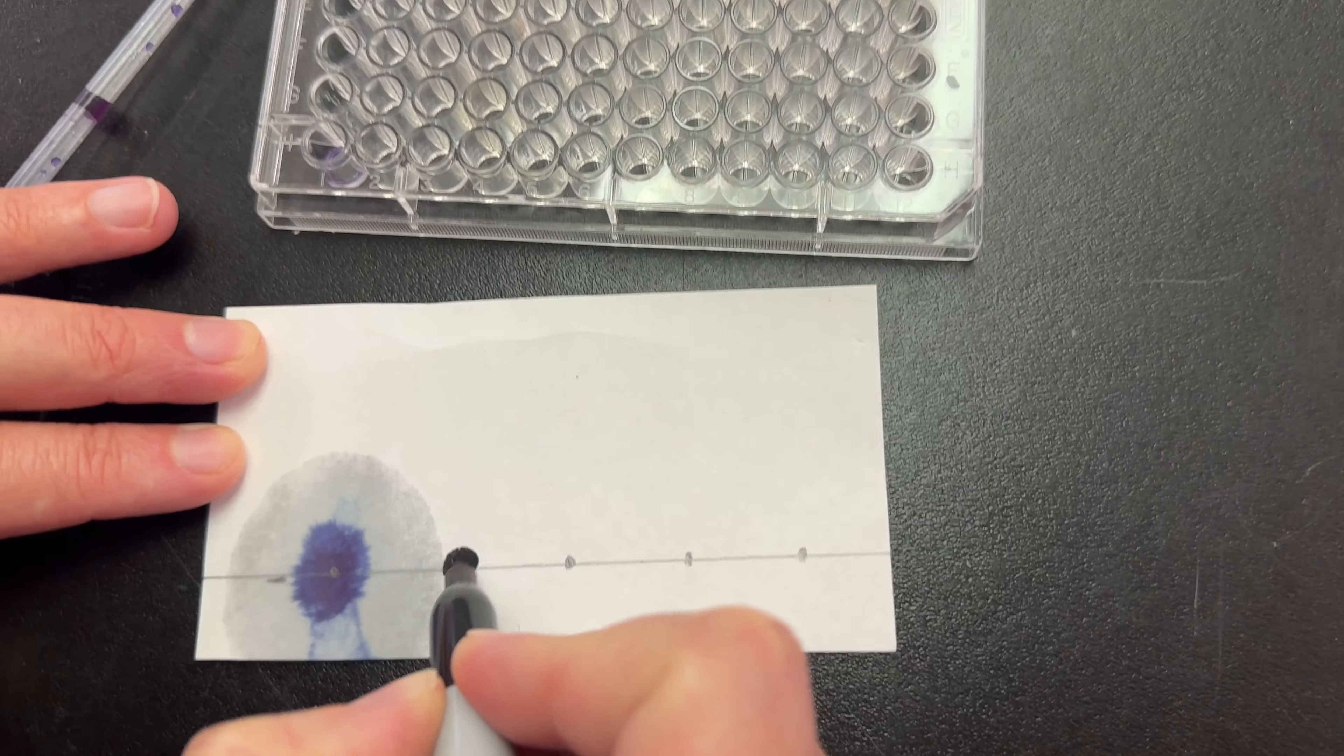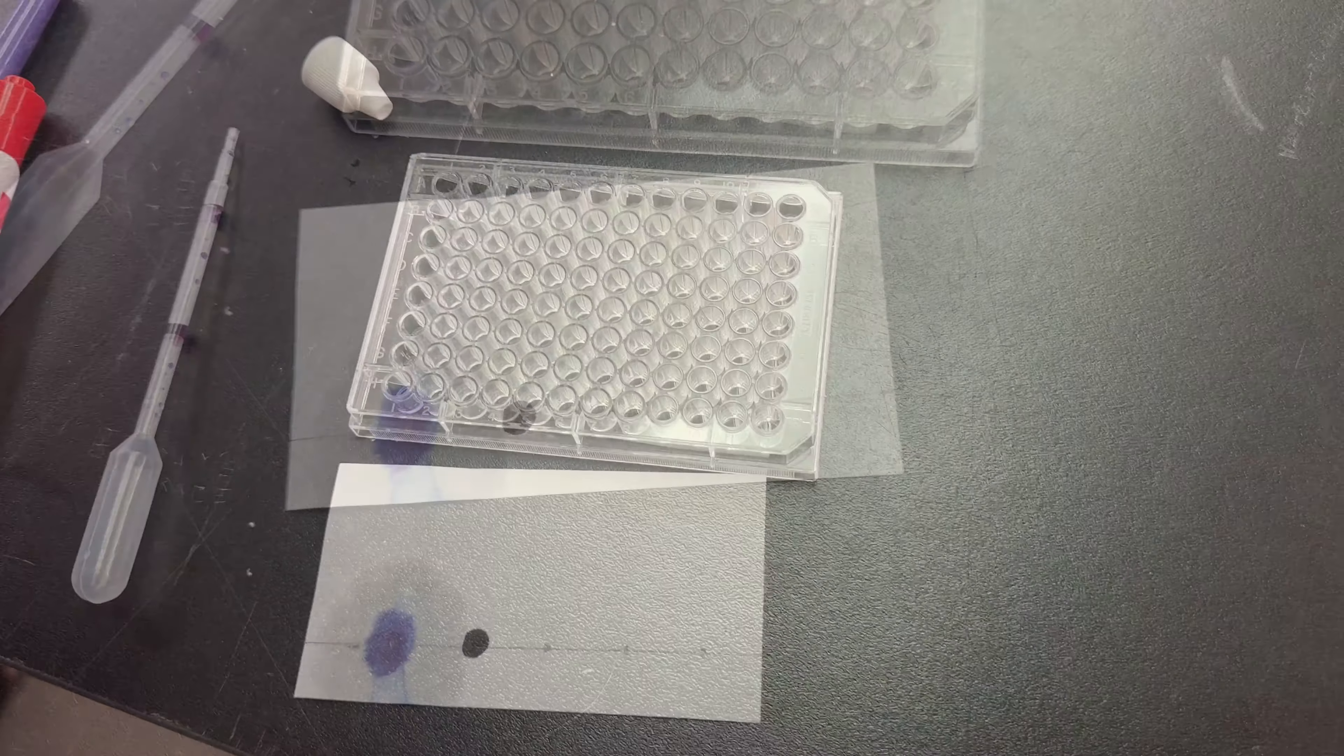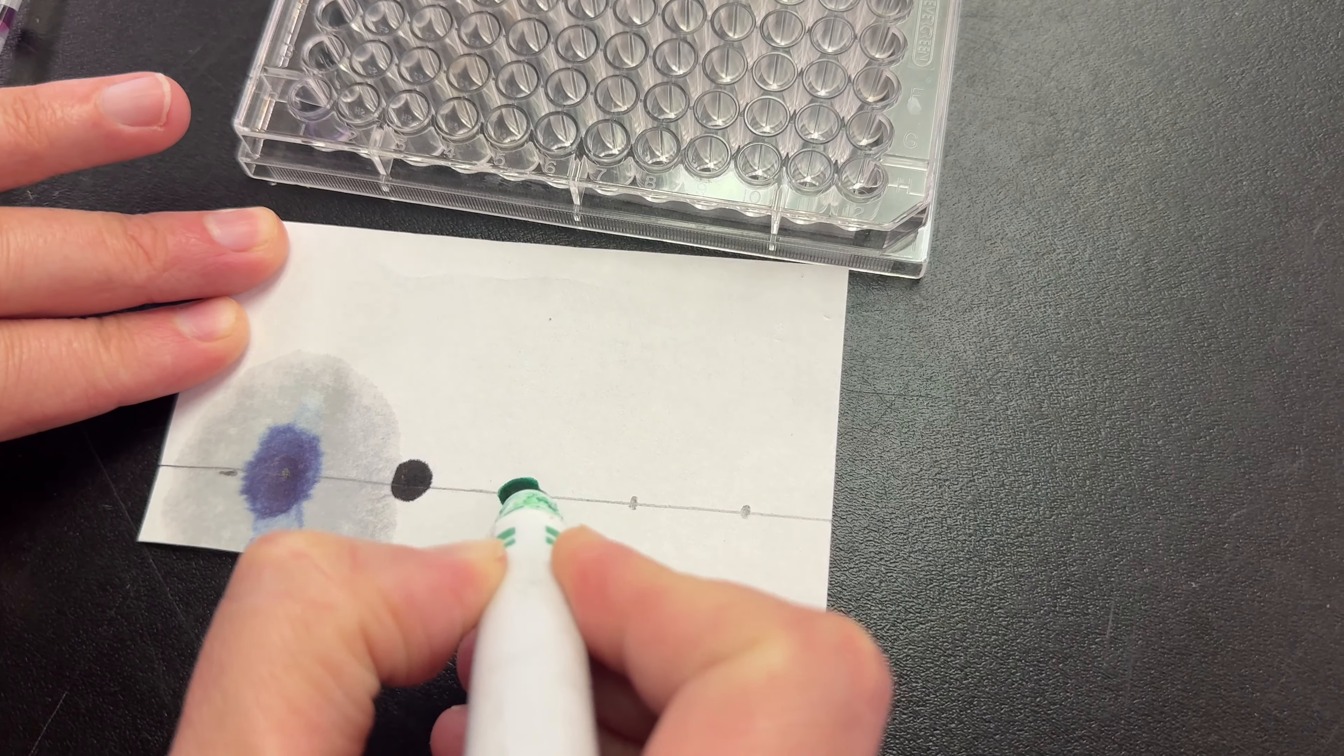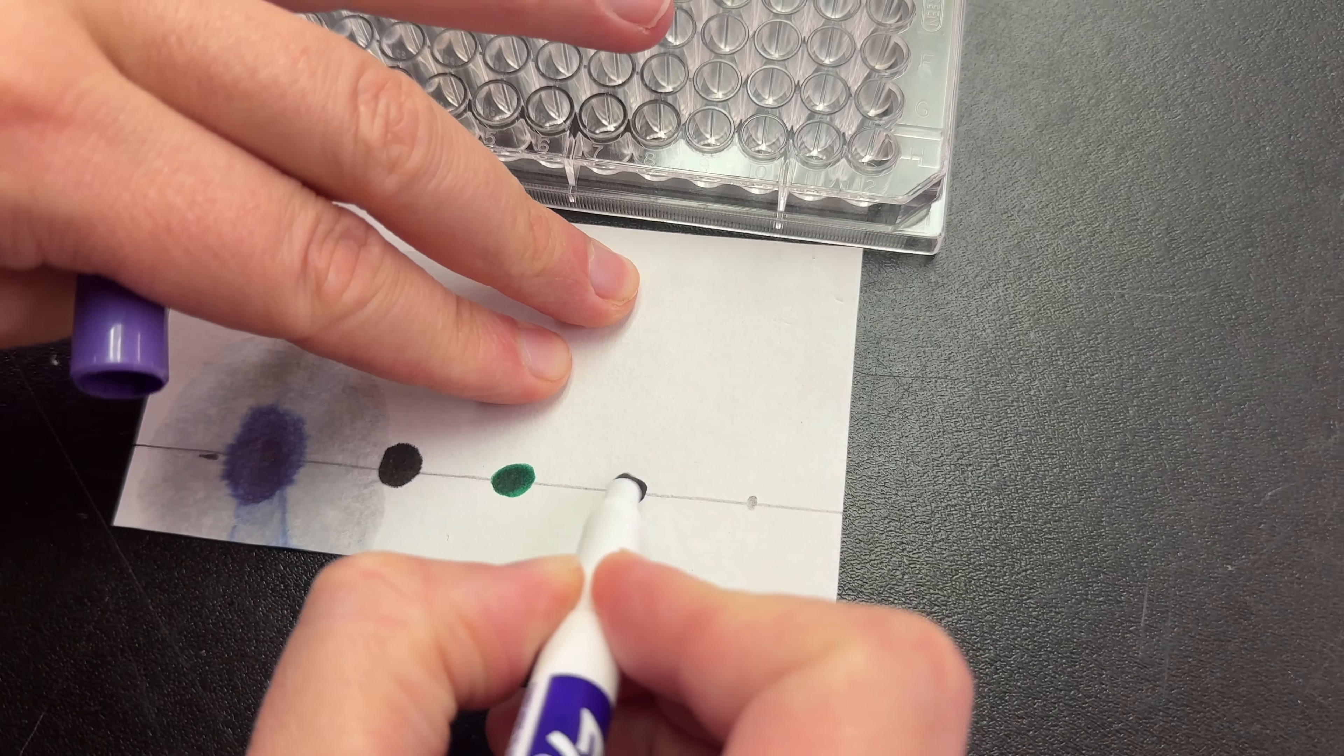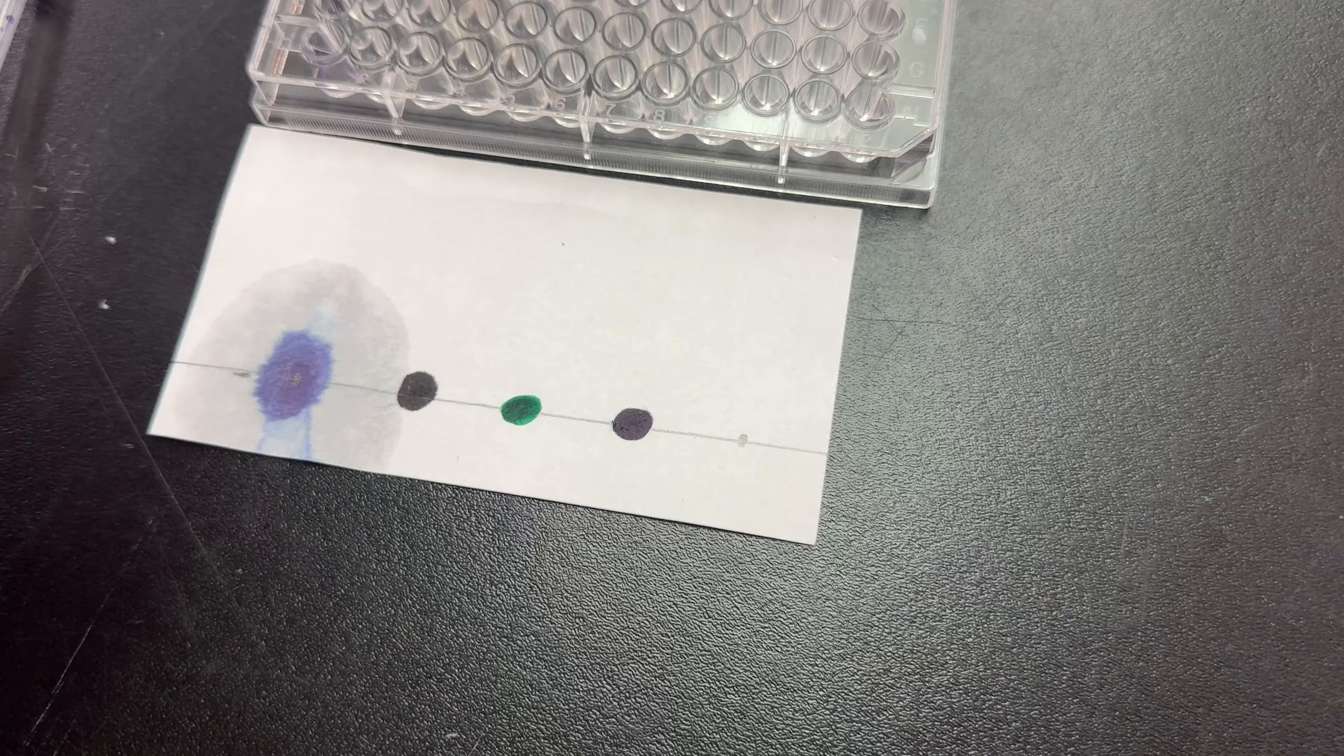Step four: experiment with other dark water soluble liquids such as another felt pen, food coloring, beet juice, etc. Use a mini pipette to put drops of these materials on the other marks. For this experiment, I'm just going to use other felt tip pen colors.